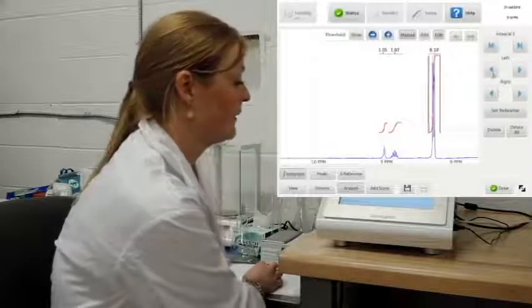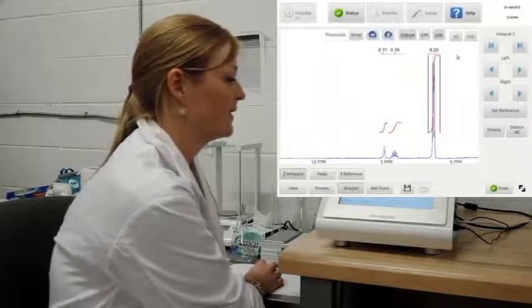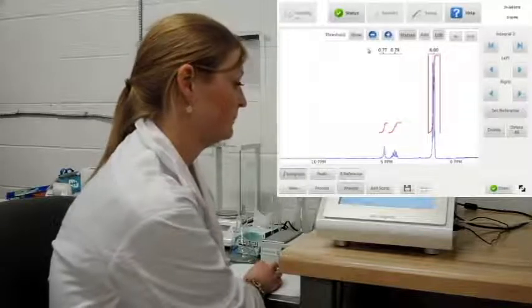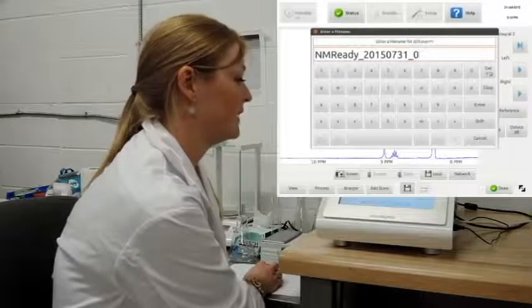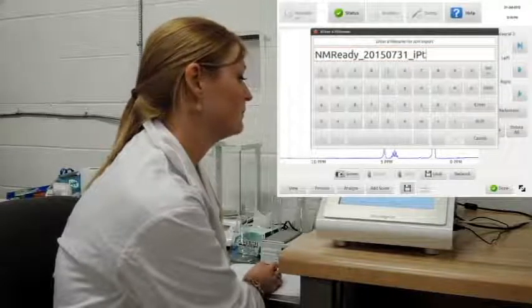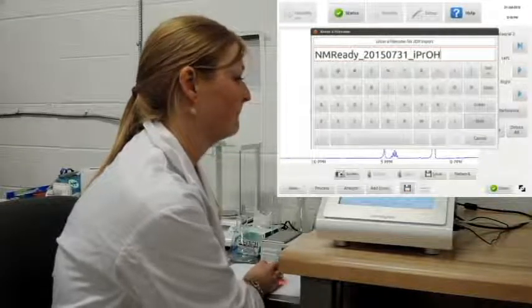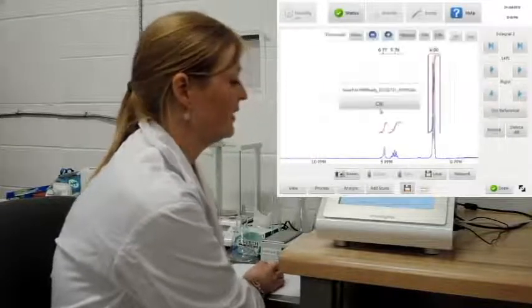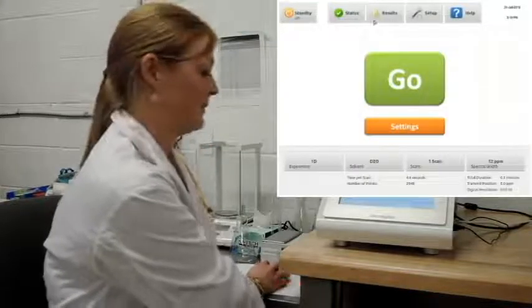Okay. Again, I have 2 methyl groups, so I'm going to go ahead and set the reference to 6. So they integrate approximately 6 to 1 to 1. I'm going to save them locally again, and I'll show you how to export them at the end of this demonstration. Okay. Everything you save to the unit gets put up into this results folder here, and again, I'll show you that at the end of the demonstration.